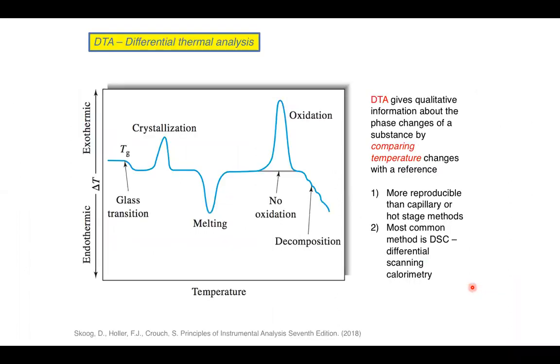Okay, so that's a TGA example of something you might have to do. So DTA, differential thermal analysis. This is looking at the temperature thermal flow through a sample. Instead of heating something up until it decomposes, well, we can do that as well, but usually people don't like that because DSC or DTA instruments are usually pretty expensive, and they're usually hard to clean, and that's time consuming, and it means other people can't use it. So it's better to run a TGA first and totally blast your sample to see what temperature it decomposes at, and then just avoid reaching that temperature.